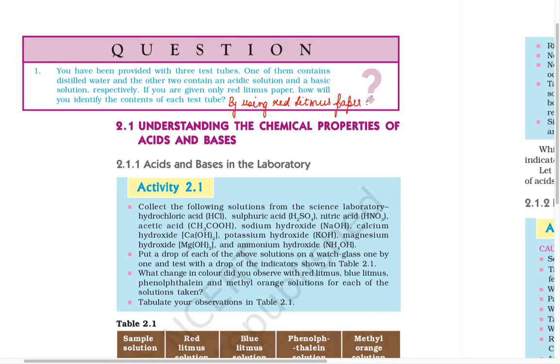It's very easy, and this can be done by noticing the color change of the red litmus paper. And how can it be done?